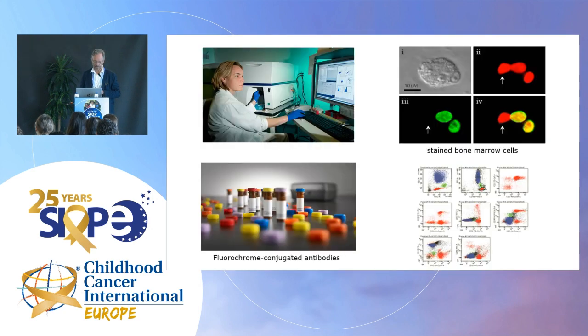Conflict of interest. So flow cytometry is a technology which dates back into the 80s, with the nowadays machines which can be used in diagnostic workup having up to 12 to 13 colors of fluorescence. What means that you can assess cells with different antigens on the cells, up to 12 or 13 parameters, which allows a very detailed information about cells and their antigenic repertoire.